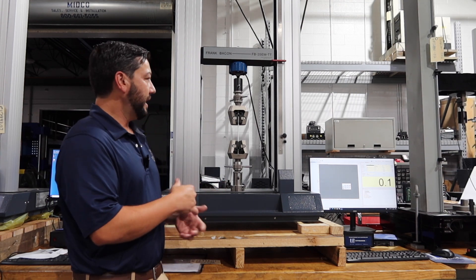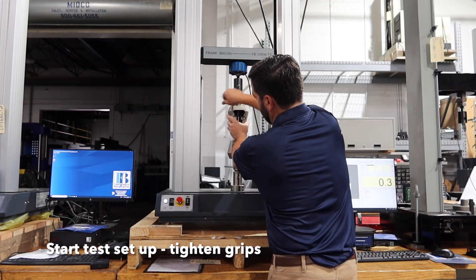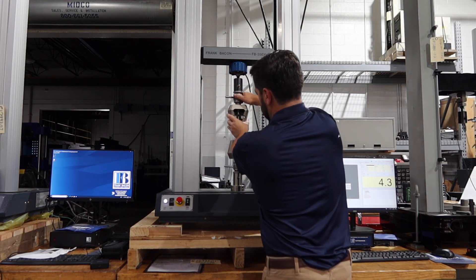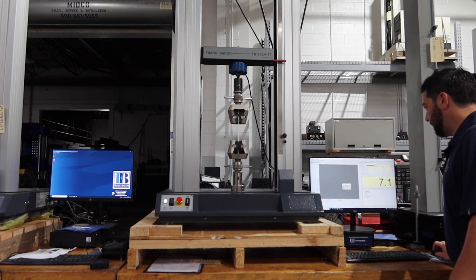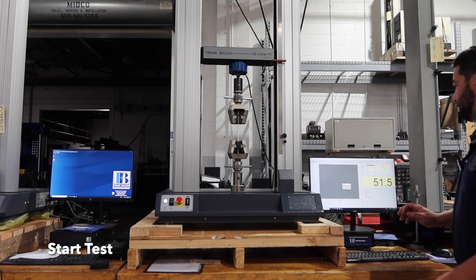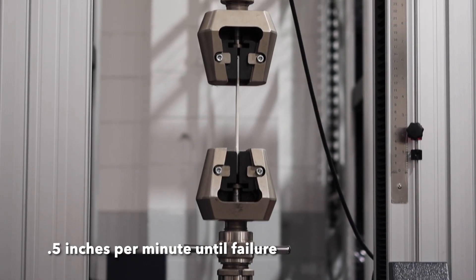Today we're going to go over how to run a test and how to get started. Everything's set up, so I'm going to go ahead and tighten the grips on the specimen. Now that I'm tightened up, I've got live load on my controls. I'm going to press start and we're testing — in this case moving at 0.5 inches per minute until failure.